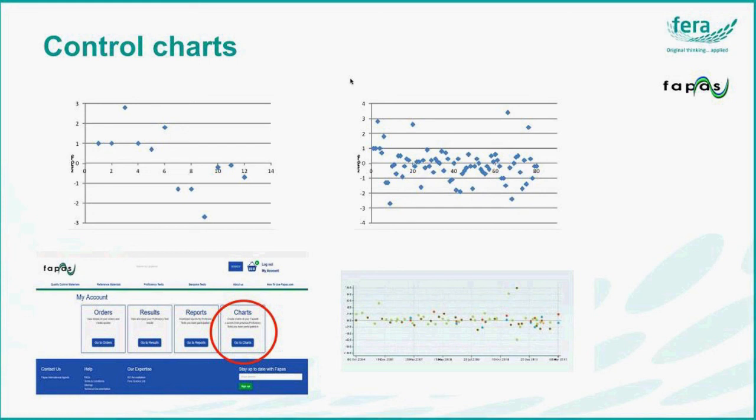So a few data points in the top left chart here doesn't really tell us whether there's a positive bias or a negative bias. But by the time we've got about 100 data points, 100 z-scores for similar PTs, we can see that actually overall the trend is around about a z-score of 0. In other words, there is no problem with the performance in general.